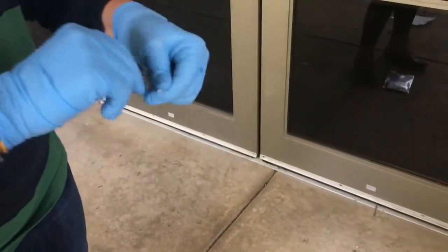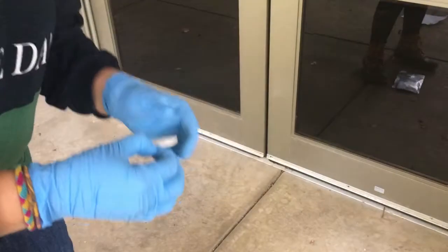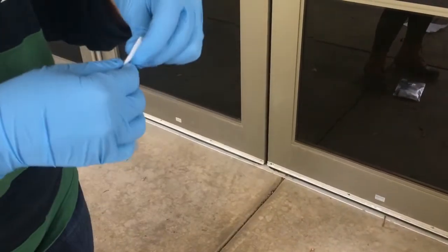To do this, we'll take the ghost wipe outside of our collection sample kit. Wearing our gloves, we'll open the dust wipe, take it out, and unfold it all the way.